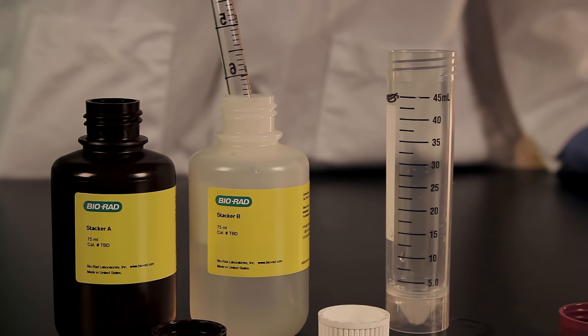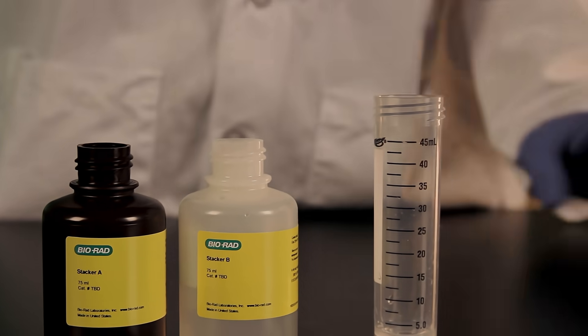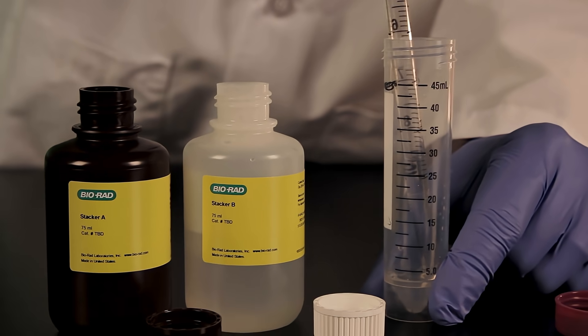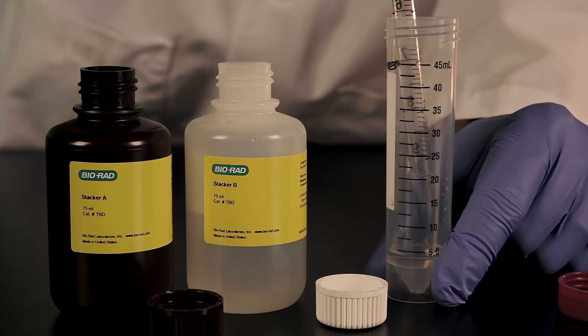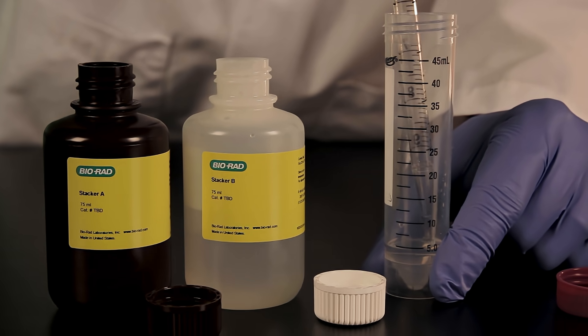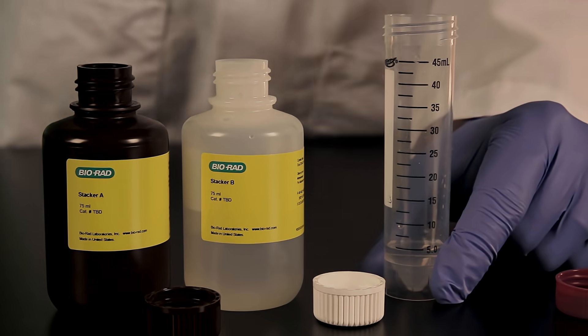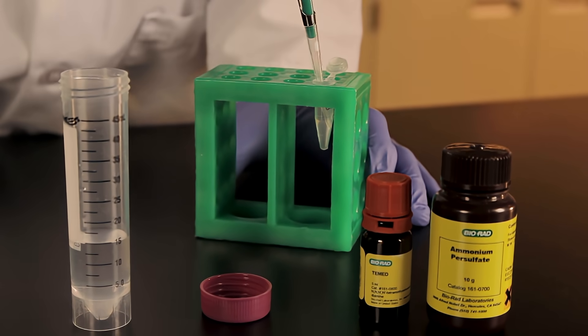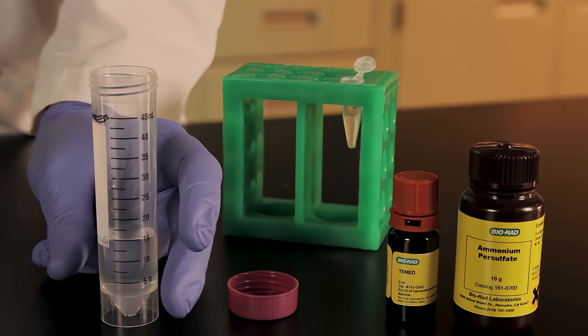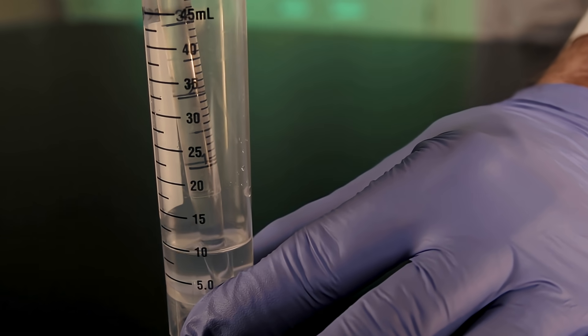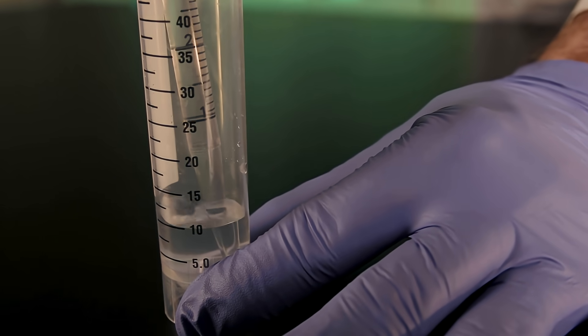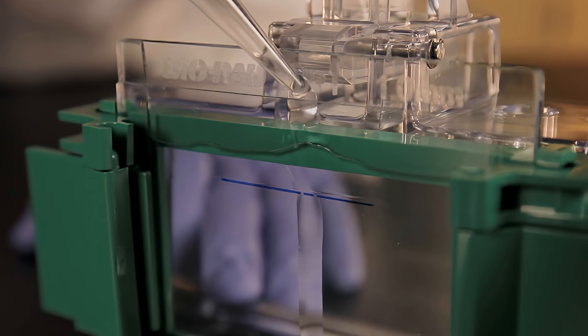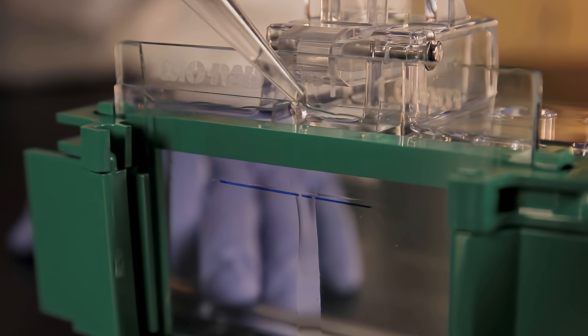For fastest results, the stacker can be poured without waiting for the resolving gel to polymerize. Prepare the stacking gel acrylamide solution by combining equal volumes of stacker A and B. Add the appropriate volumes of TEMED and freshly made 10% APS to the combined stacking solution and mix thoroughly, again taking care to avoid introducing air bubbles. Pour the solution slowly down the middle, completely filling the cassette.